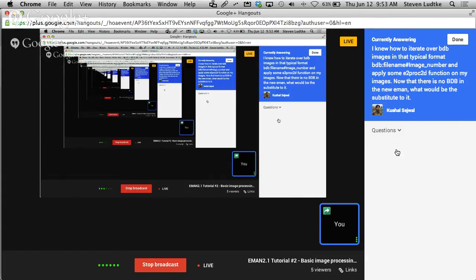The nice advantage to that is they're all flat files. So you can just move them around. You can do whatever you want with them. You can use them on shared file systems, although you could still run into problems. If you're using a shared file system and you have 2 different computers both outputting to the same HDF file at the same time, you could still cause file corruption and other problems like that. So you have to be a little bit careful, but you're not going to have these issues with corrupting the BDB, corrupting the database, and having to try and recover it anymore. So hopefully that covers the question. Feel free to ask a follow-up if that didn't answer.